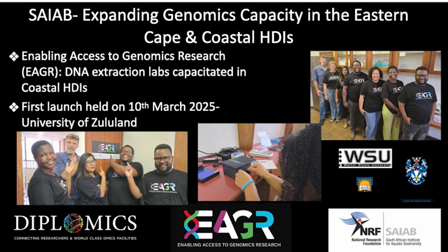The 3rd step of the SAIAB Spatial Transformation Program is now in play this year, where in partnership, we have capacitated DNA extraction labs at these 3 different institutions. In March, we did 2 road trips to these universities to go and meet the students, researchers and staff members at these labs, and to launch these labs. And literally it's a very basic lab: a set of pipettes, Qubit, NanoDrop, centrifuges, basic DNA extraction facilities.